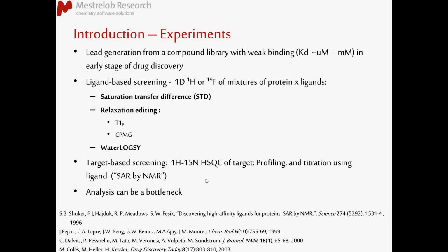One thing that we've been looking into lately has been looking at 2D data. In that sense, we have started taking our first steps, binning 2D data in a very effective manner. That will help you in other types of experiments. But I thought this should be mentioned at this point.